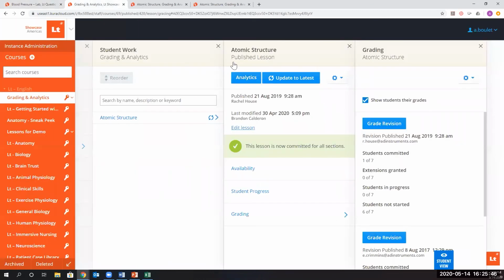Okay, so those are the main new updates that we have right now. I'm going to look and see if there are any other questions we have at this point. I think we went over the example data. Again, Kristen, I'll be happy to send some more information on how to put the example data in from LabChart. I don't have that file ready right now, but I'll definitely follow up with you for that.